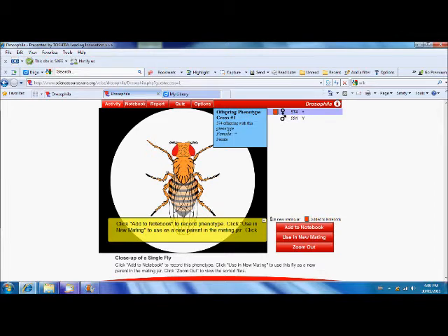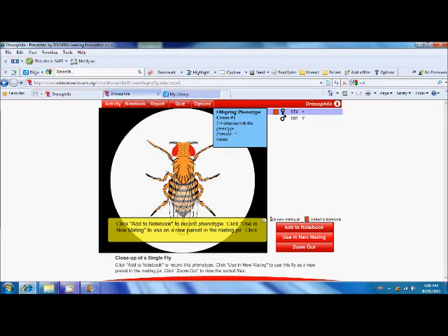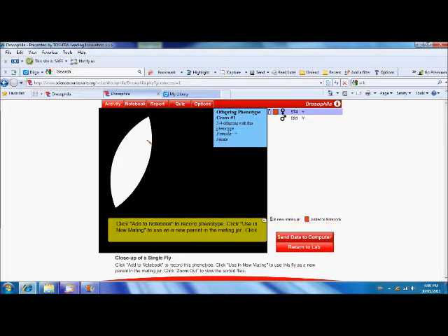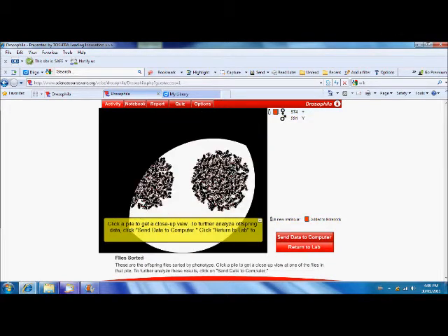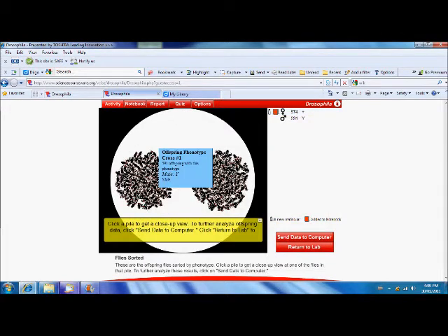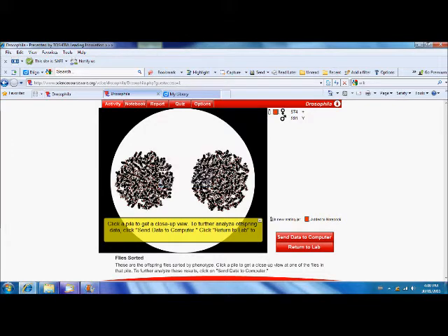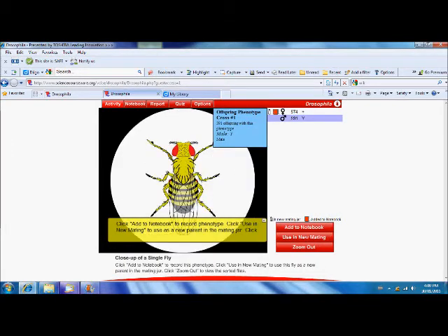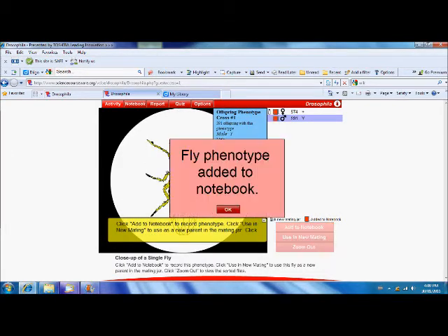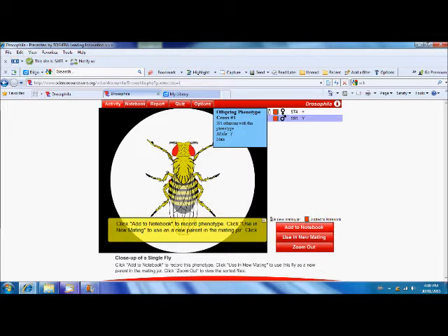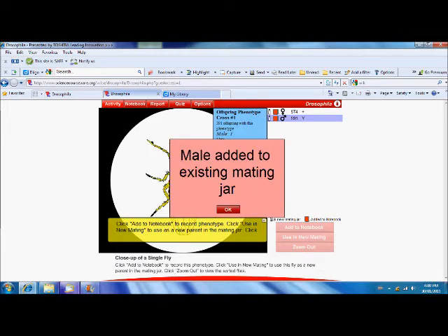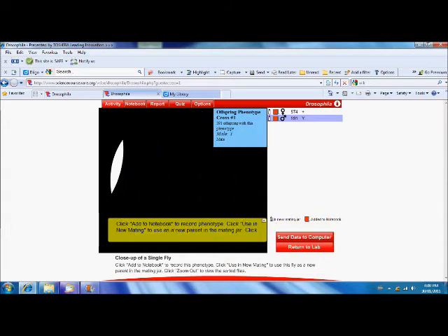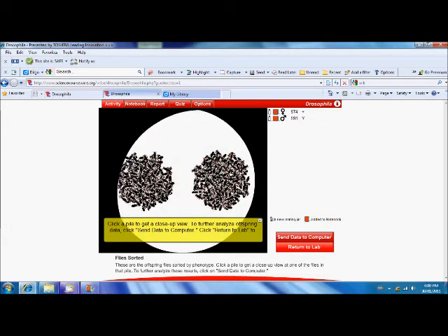And we have to do a second cross. So, let's use that female in a new mating. Okay, zoom out. And let's look at our males. Our males are yellow. So, let's add those to the notebook. We've got to use one of them in the next mating jar. And we'll zoom out.